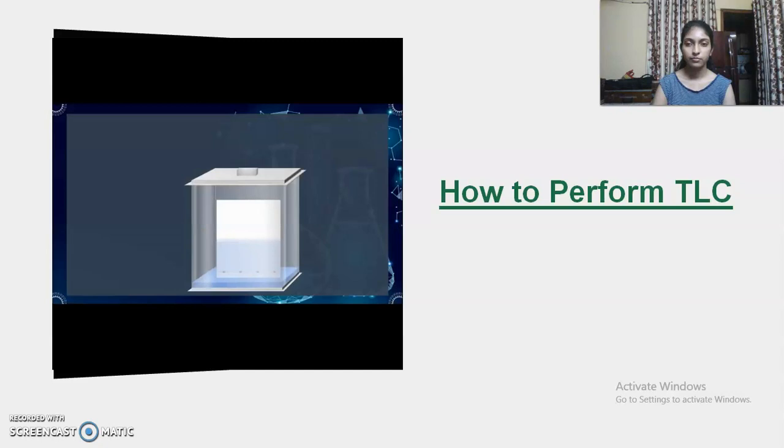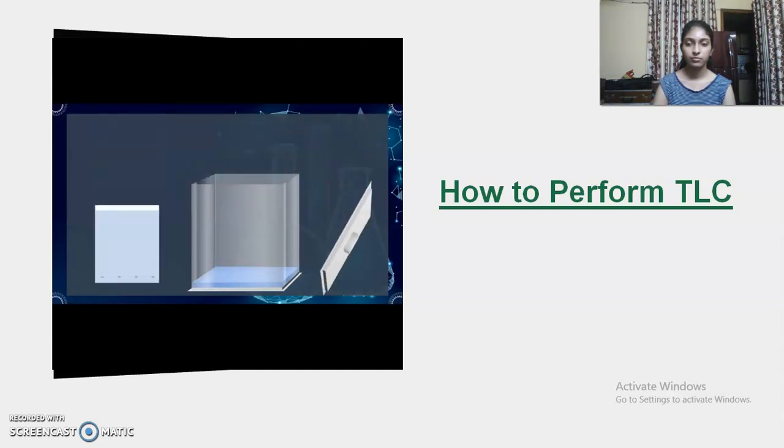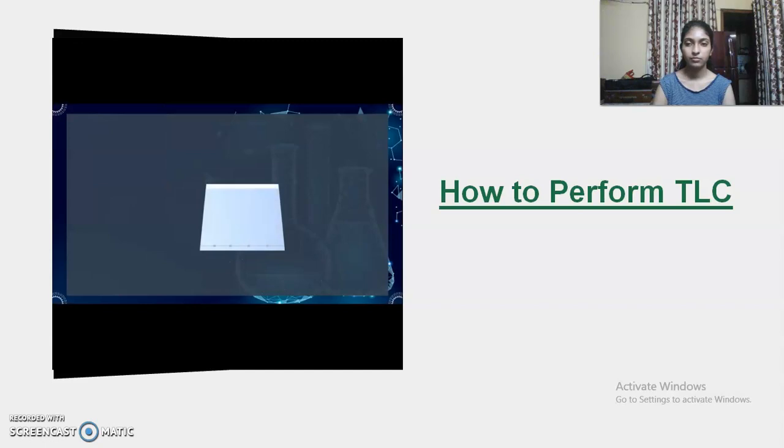The solvent is allowed to rise until it almost reaches the top of the plate. That will give the maximum separation of the components. The plate should be removed from the chamber before the solvent front reaches the top of the stationary phase. Then this front is marked. The plate can be dried in ambient air, or under the warm air of a dryer.